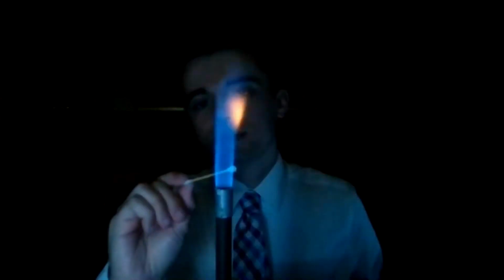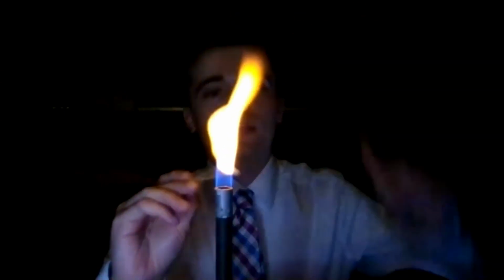We're going to burn this and see if it changes color. Whoa. Look at that. Isn't that cool? What color would you say that is? Look at the very tip of the flame, all the way up there, to see what the color is.